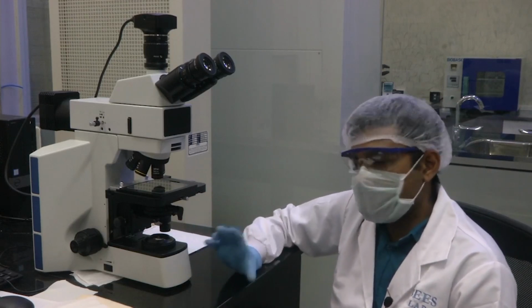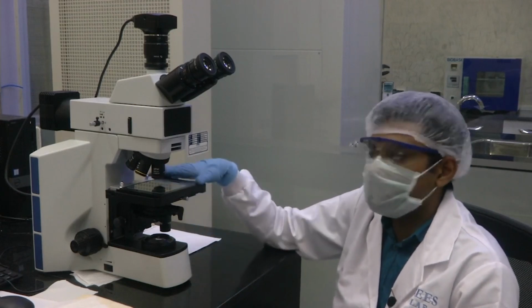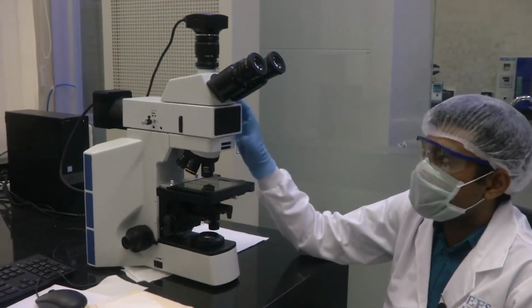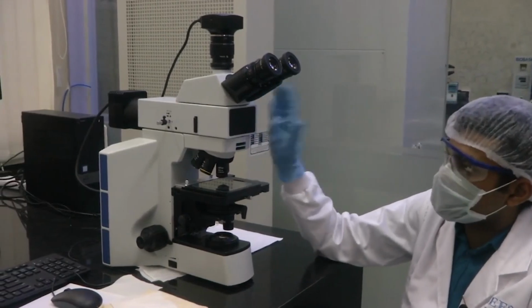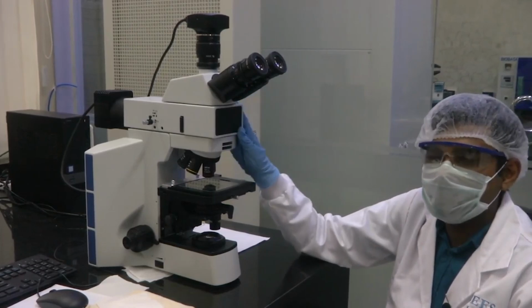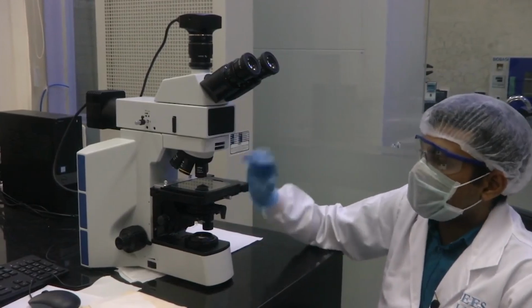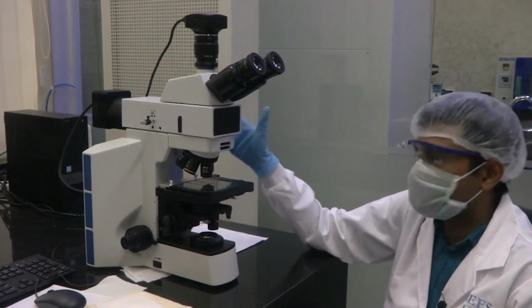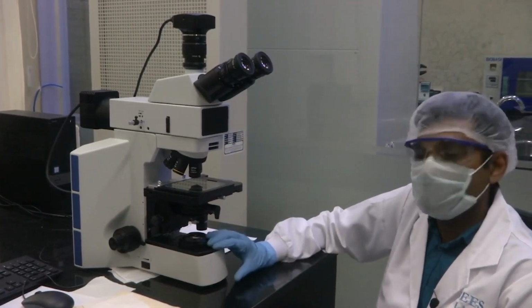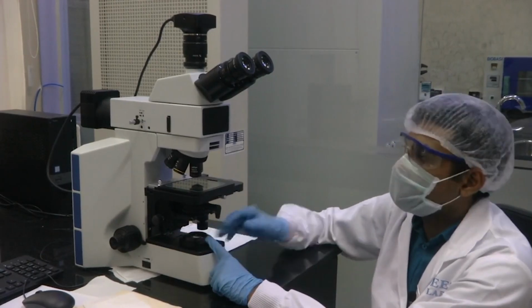Now, let us actually look at the microscope and understand what it is. We have the metallurgical microscope here. As you can see at first instance itself, this is a much more complex microscopic arrangement as compared to the stereo microscope that we saw last time. Before I go into the details of the different knobs and features available on the microscope, let me introduce the basics first. This microscope has both bottom illumination and top illumination.